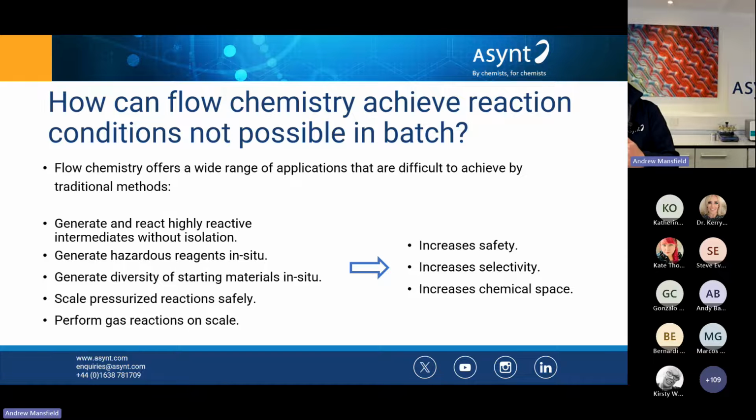But if we take that principle, we can do things like create highly reactive intermediates without any isolation. So we can make those materials that would have a low shelf life or that are difficult to find, or starter materials that are just not apparent in fine chemical catalogs. So we can create those reactive intermediates without any isolation, and flow it into a secondary reactor with another substrate. That simple two-component or two-reaction system is a really easy step to transition from that A plus B one reactor. That's difficult to do under batch conditions.